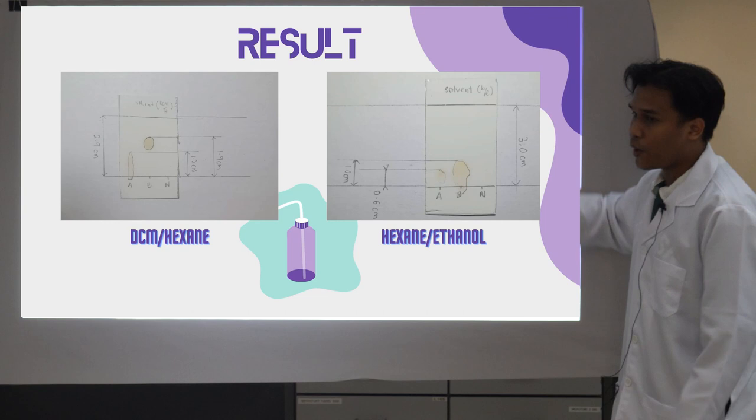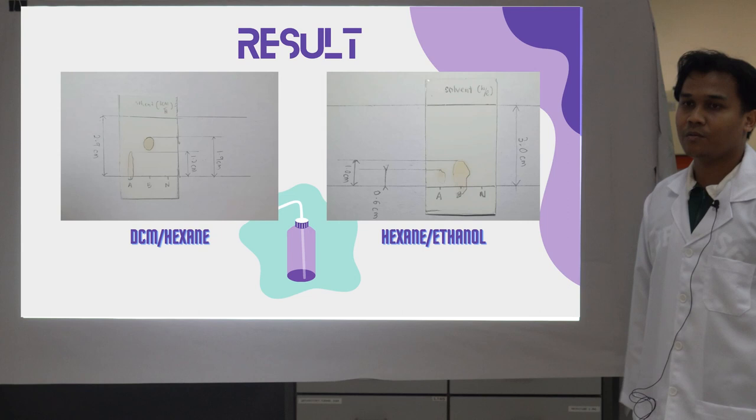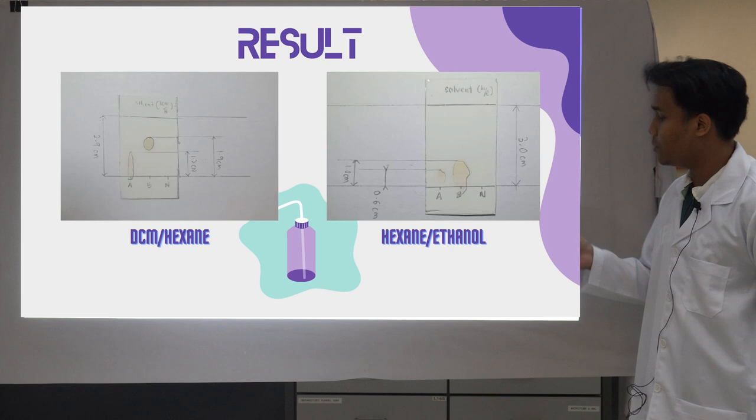We can use any unit because the retention factor is dimensionless. So it is okay to use cm, meter, or millimeter. I will pass to the next presenter, Brother Iqbal.